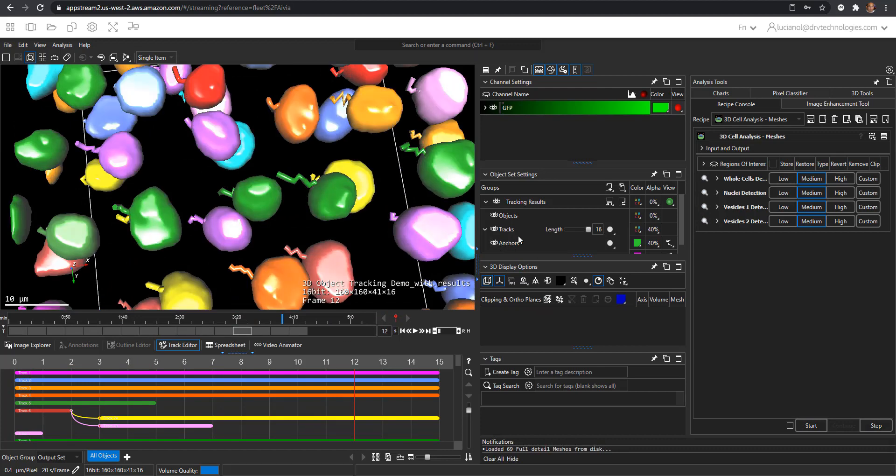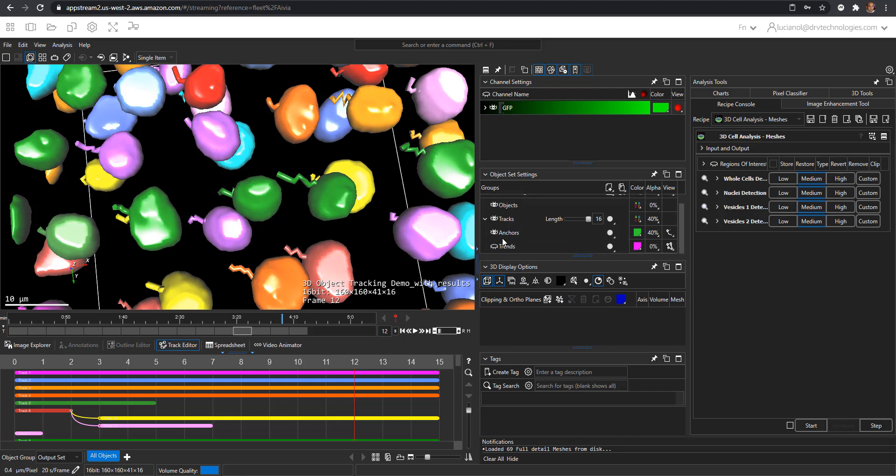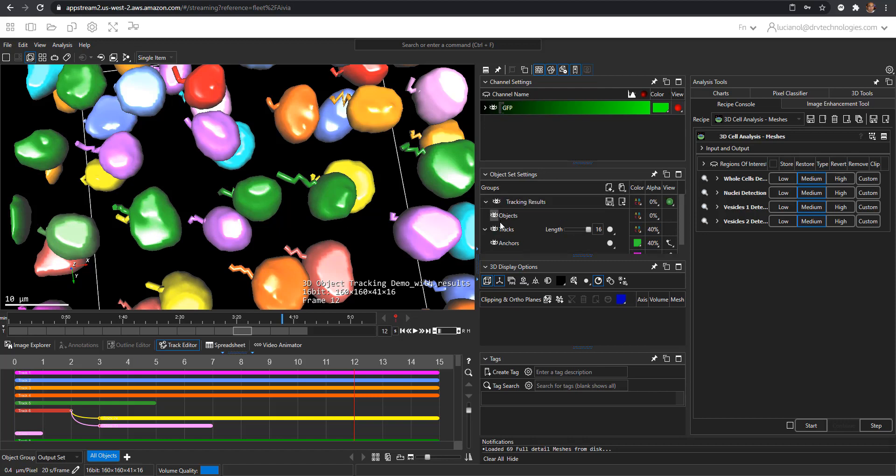In addition to tracks you also have the anchors. These are the center points in the data in the cells. They are not visible right now because they are inside of these meshes which are mapped here as objects.